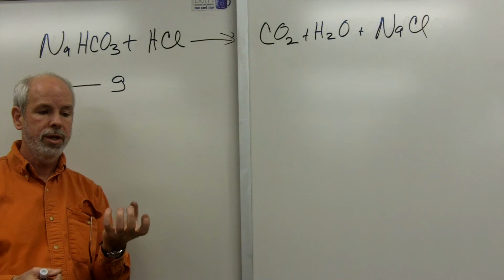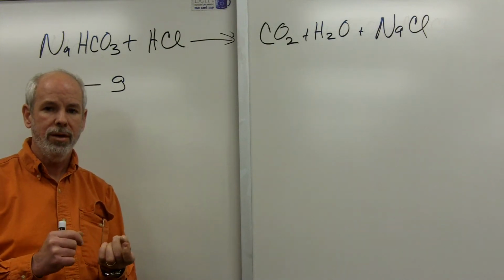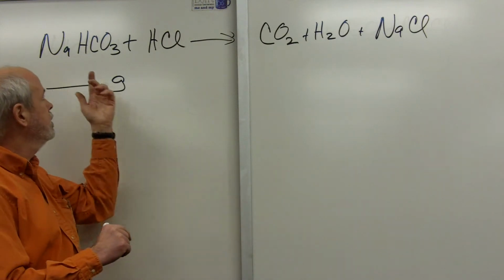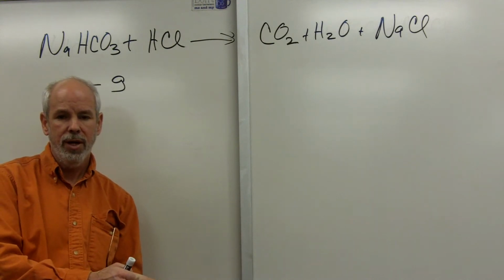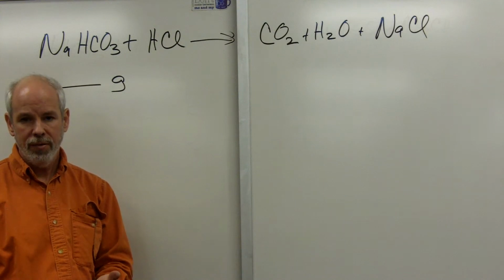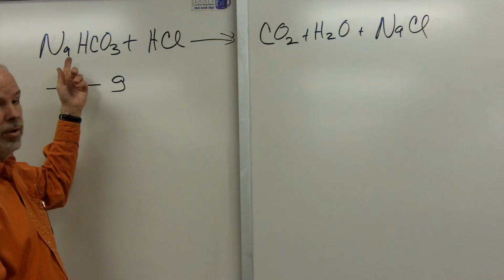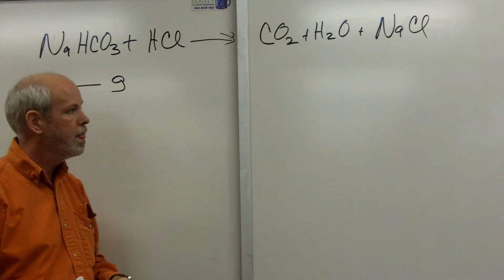What you're going to do is take a test tube with a little boiling chip in it. It's just a little rock that helps things boil smoothly. And you will put some of this in the test tube. Now what you'll do is you'll weigh the test tube beforehand, then you'll put some in, and you'll weigh the test tube after it's in, and when you subtract the two, you'll have the weight of the sodium bicarbonate. That's in your procedures. I'm just giving you a warning.